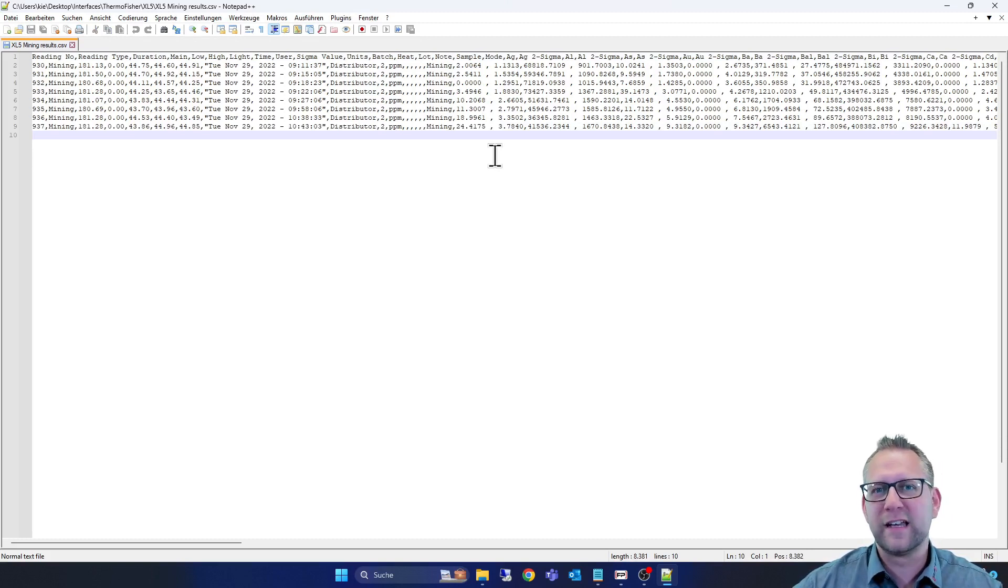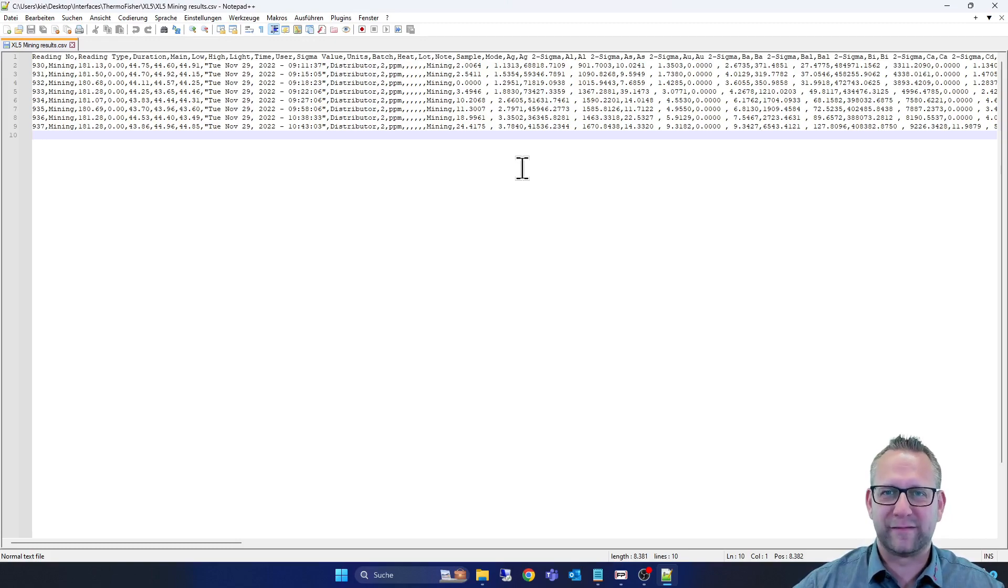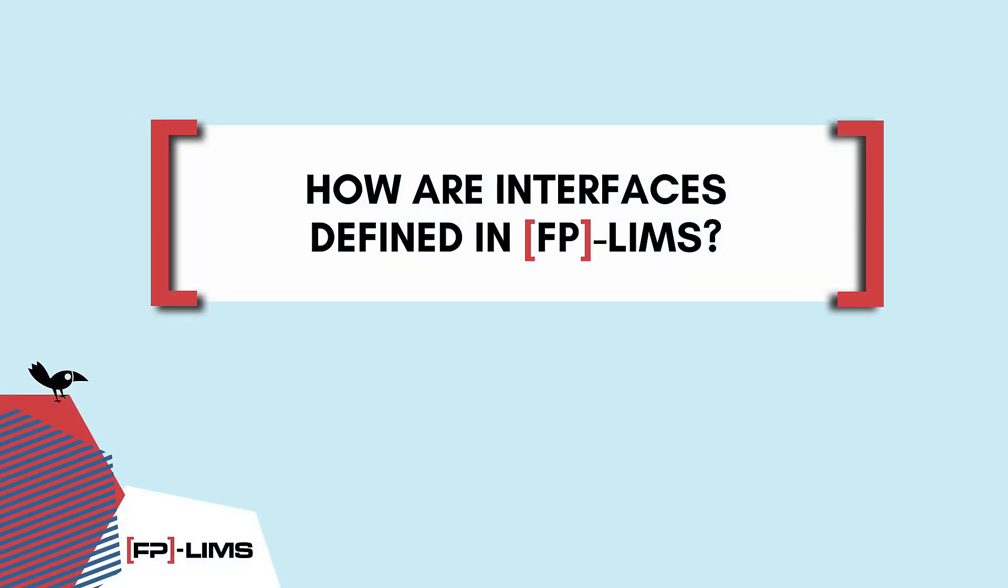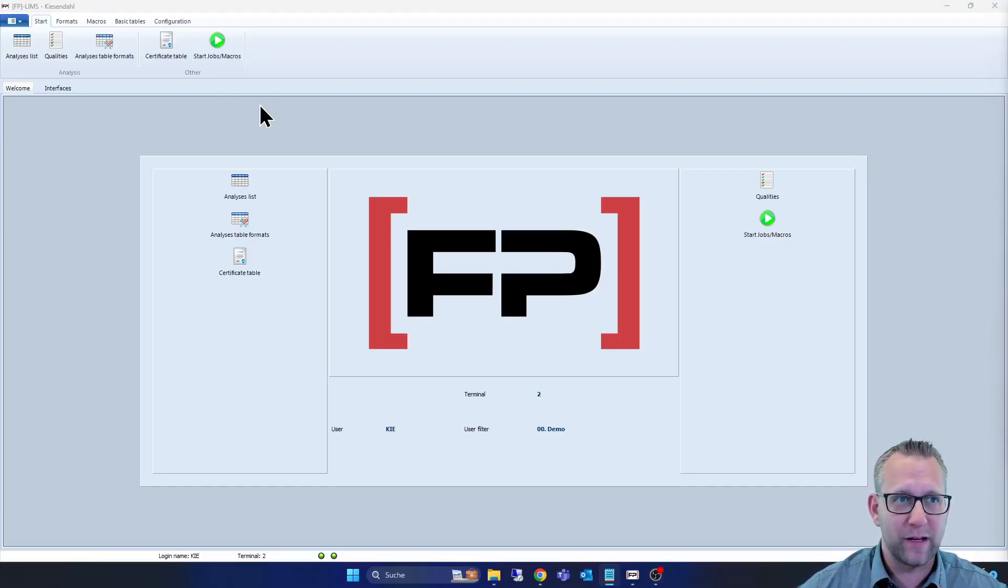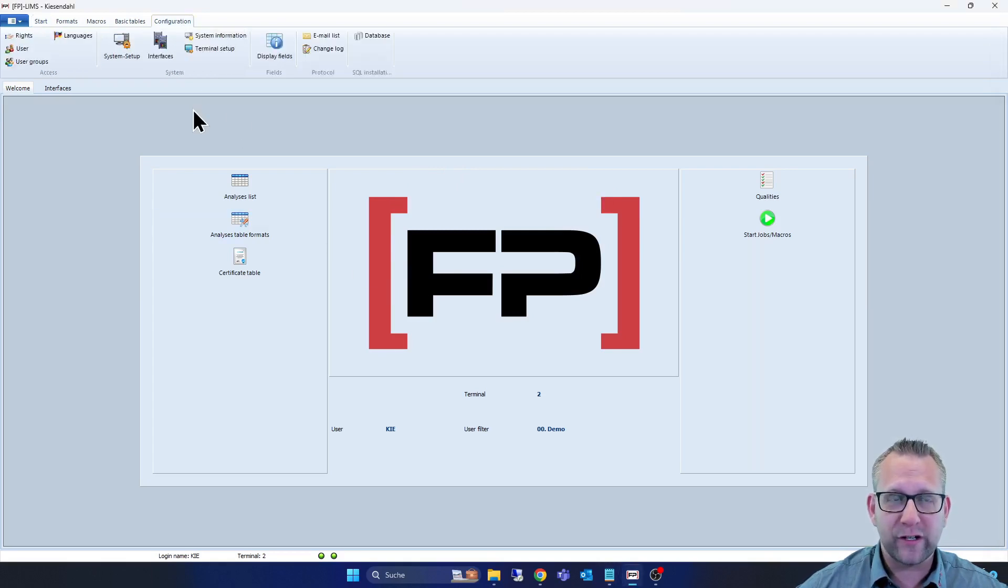If I checked all these things, we can step into FP-LIMS to see how the configuration looks like. And now we go over there. Now we are in our standard edition from FP-LIMS.